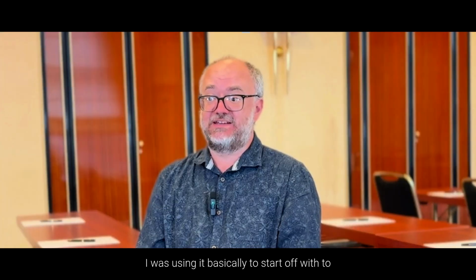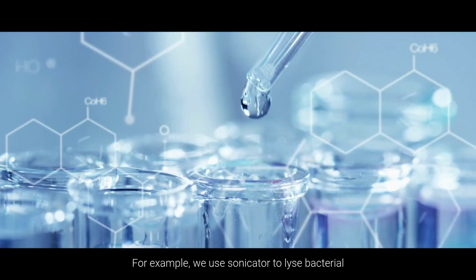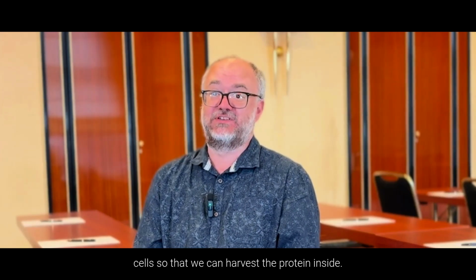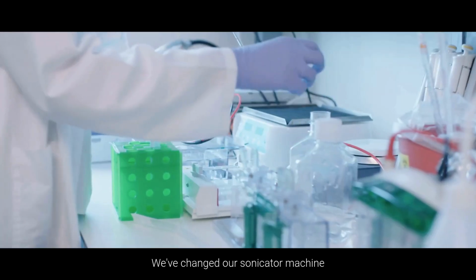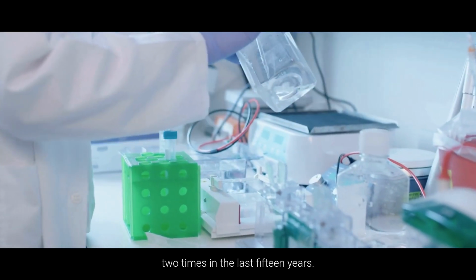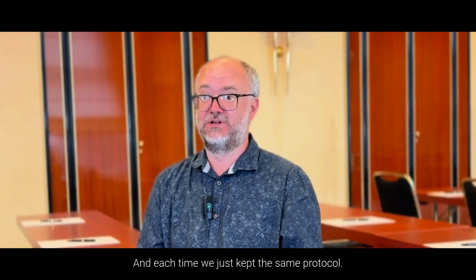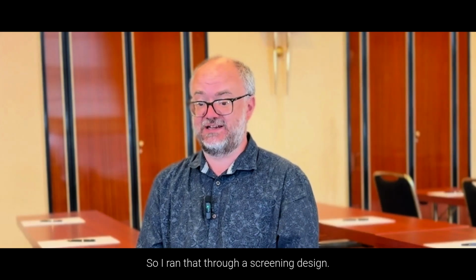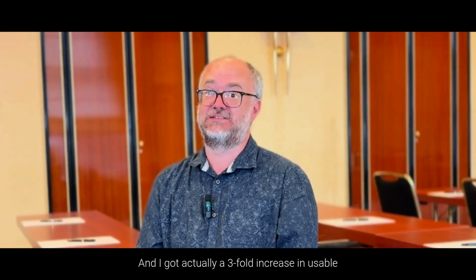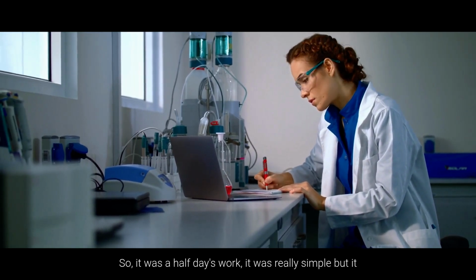I was using it basically to start off with to optimize some really simple lab processes. For example, we use a sonicator to lyse bacterial cells so that we can harvest the protein inside. We've changed our sonicator machine 2 times in the last 15 years, and each time we just kept the same protocol. So I ran that through a screening design, and I got actually a 3-fold increase in usable protein within, I think, just 12 experiments. So it was a half day's work.